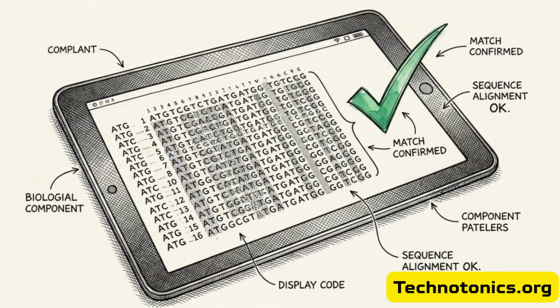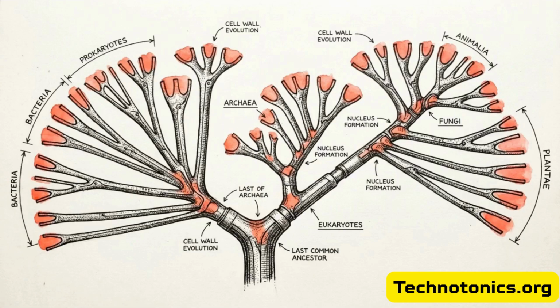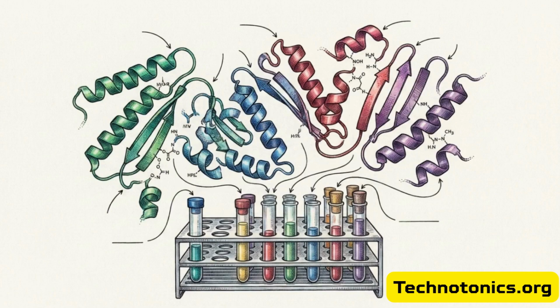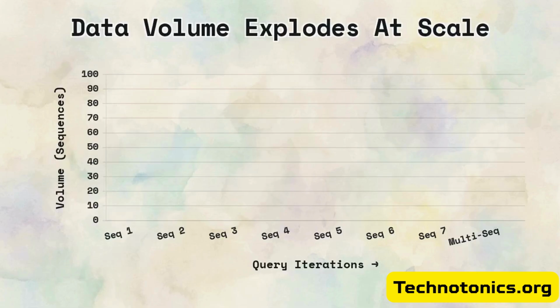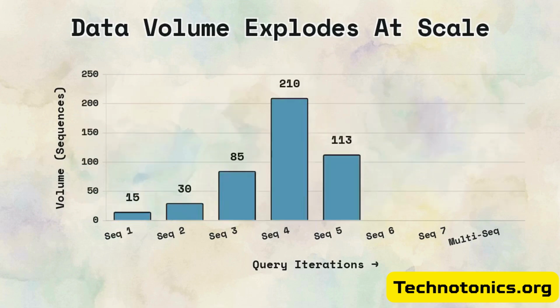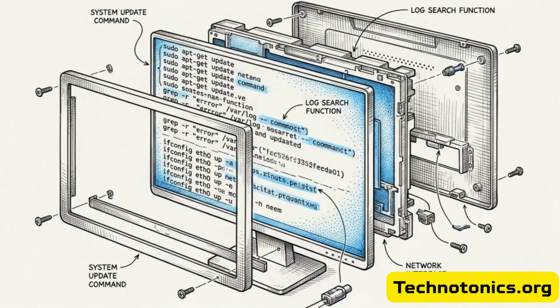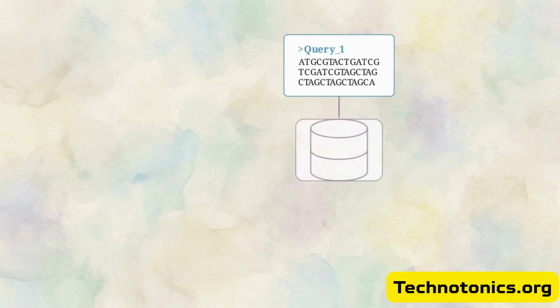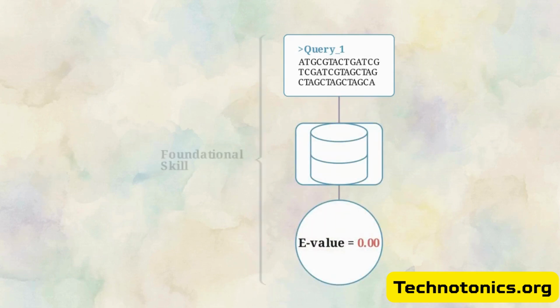With this verified match, you can trace evolutionary lineages, pinpoint specific mutations linked to diseases, or identify protein structures required for pharmaceutical design. As your research scales up to handling massive, multi-sequence datasets, you will eventually transition from this web interface to using the BLAST Plus command line tools for faster processing. Every major medical and biological investigation relies on comparative genetics. Formatting a sequence, selecting the right database, and verifying the mathematical significance of the match is the foundational skill required to conduct that research.